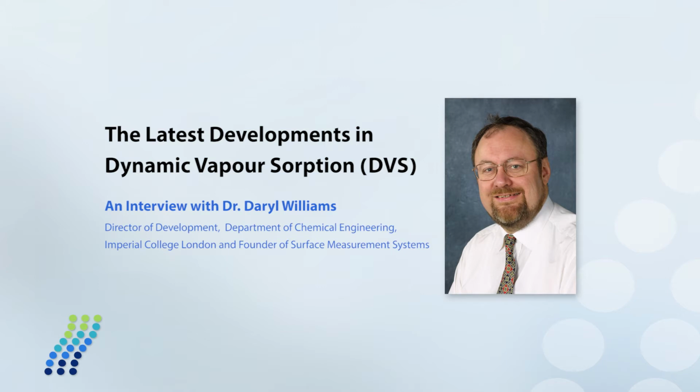It turns out when you expose a material to water vapour, it is very strongly attracted to virtually all materials. This is why we see a change in sample mass. The reason that water vapour is so attracted to materials is that water is chemically wanting to be in a liquid form. Because it's a condensable vapour, it will effectively interact with any solid state material you might have, be it organic, inorganic or biological.